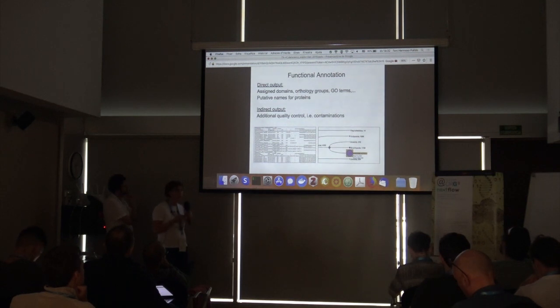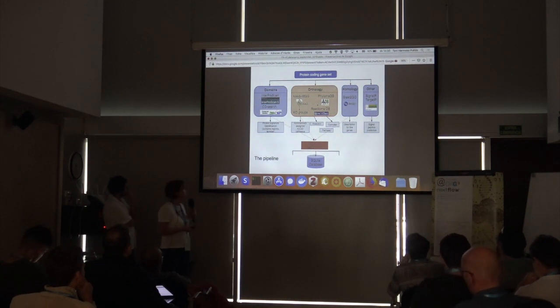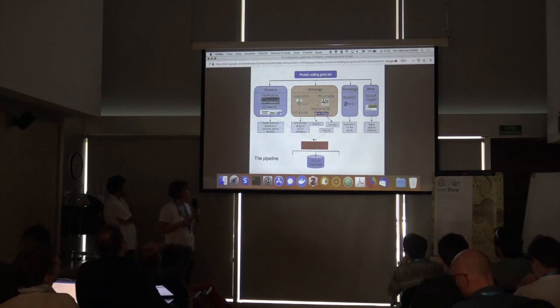So at the end of the day, this is a very small task in the whole process of novel genome assembly and analysis, but this step is very, very important for scientists. So this is our pipeline, which started many, many years ago, and therefore it can incorporate many different tools that allow different processes. We start with the protein sequences, and we have a database that accumulates all the information.